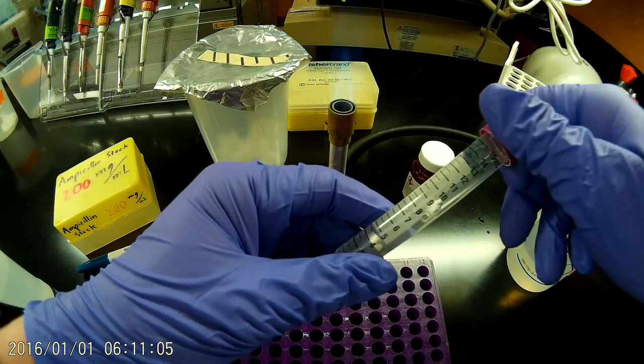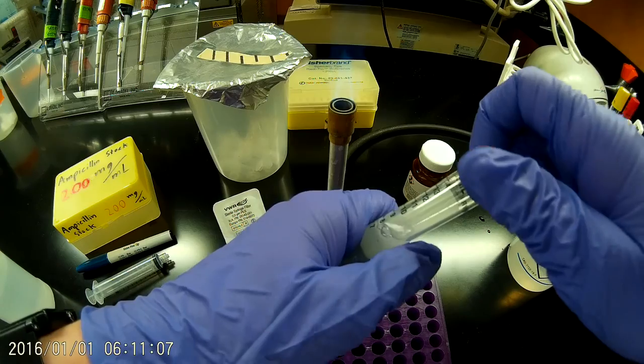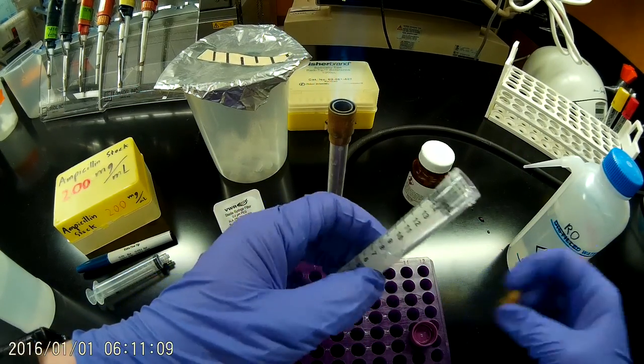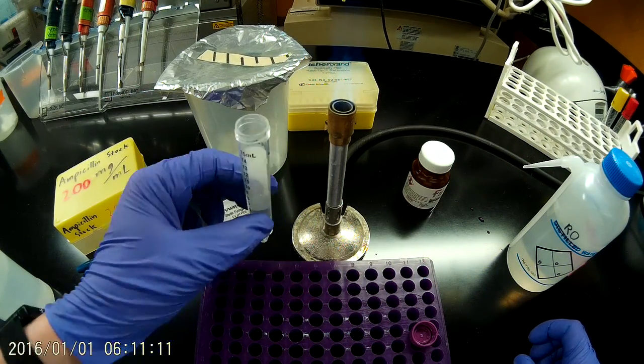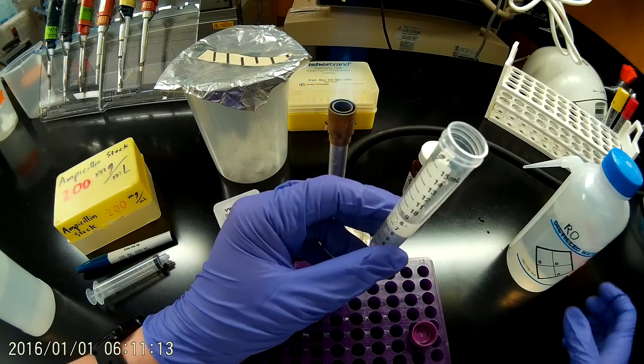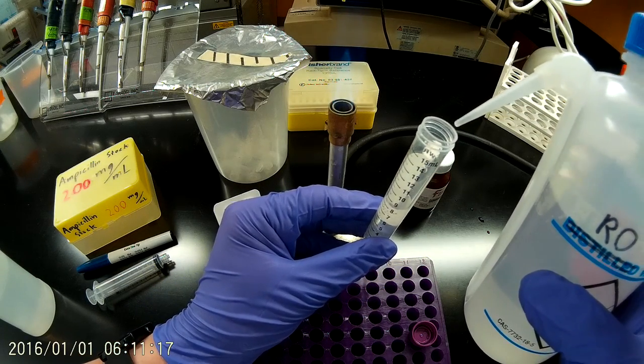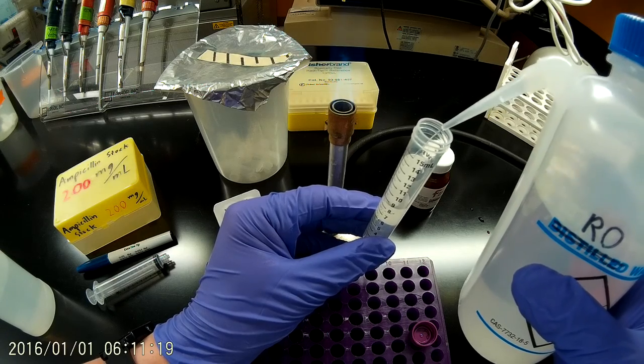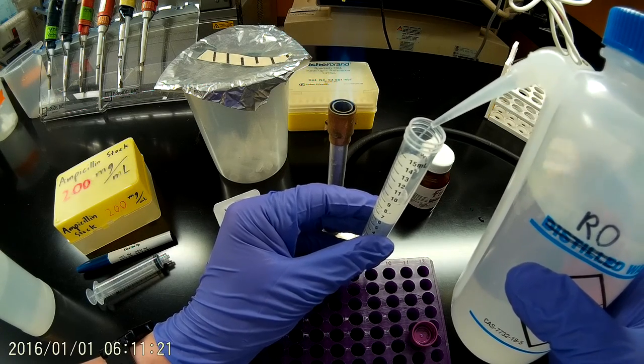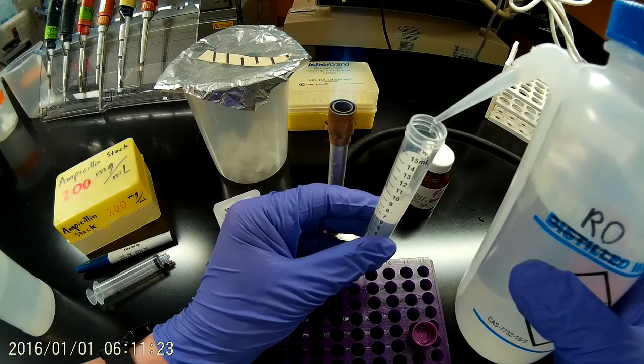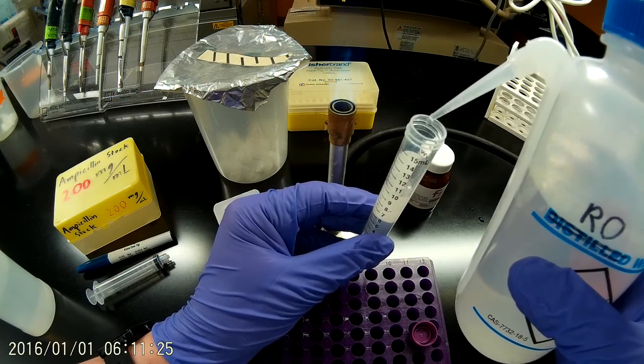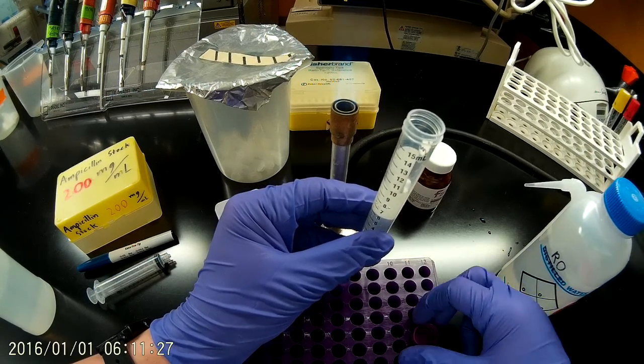We're going to want to dilute that to a final volume of 10 mils. We've actually determined by comparing our volumes in these to masses using an analytical balance that these 15 mil conicals are fairly accurate. So I think you can get away with this. And to the bottom of the meniscus, 10 mils.